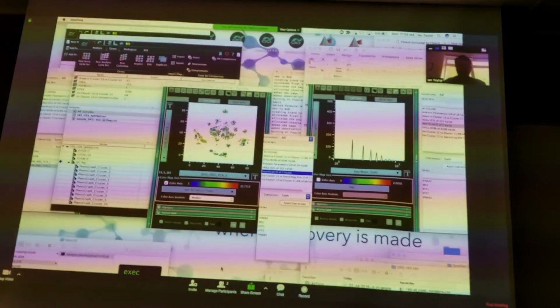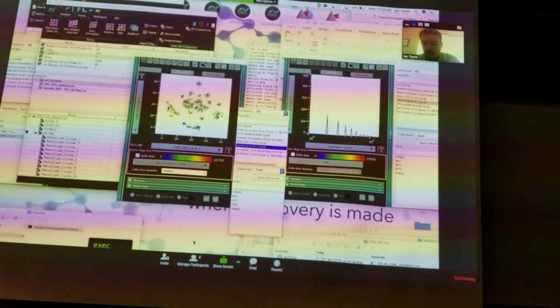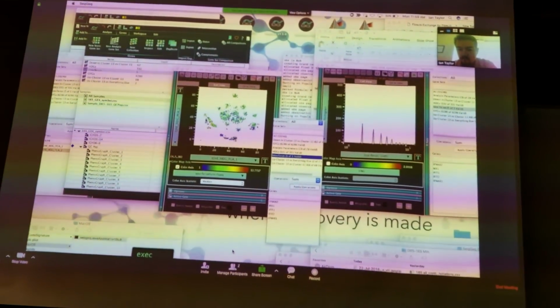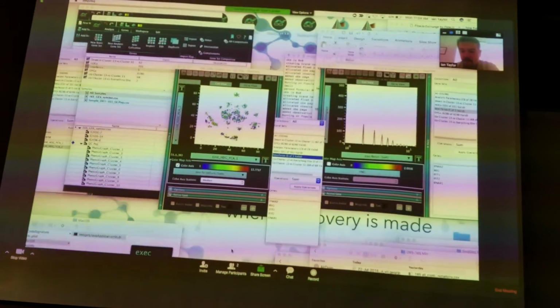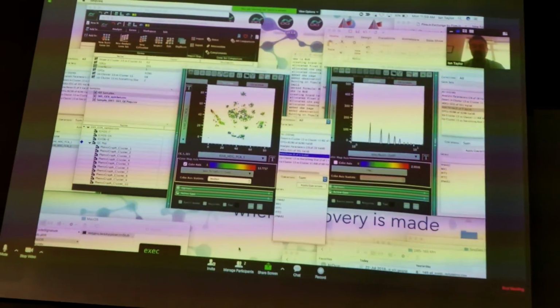Now, Ian, here's the $1 million question. Is it possible to take those and look at the VDJ set for those versus the ones that are not those? Oh, you could definitely do that. I should say that's the intended operation. Yes, okay.